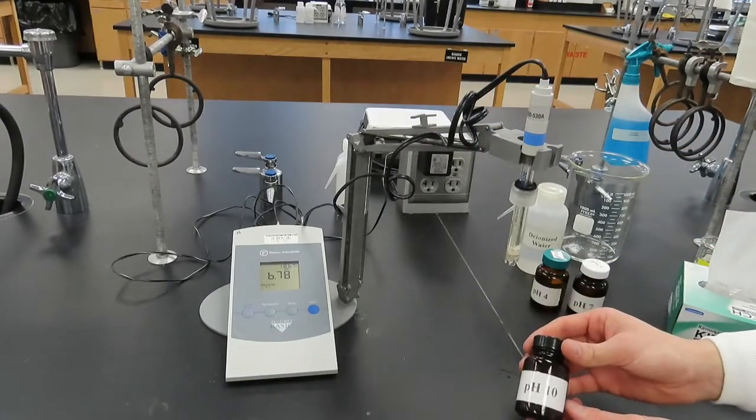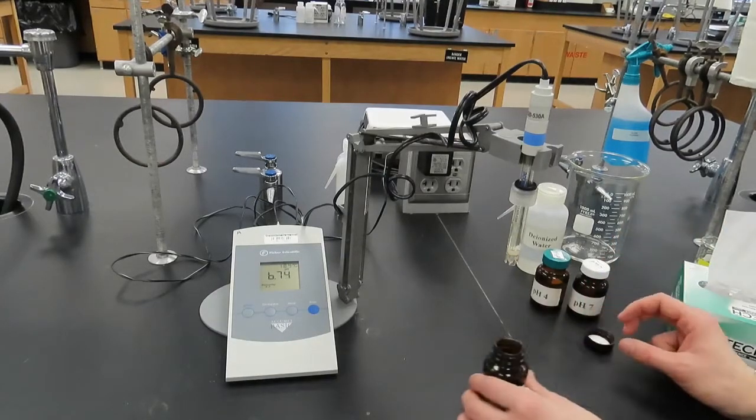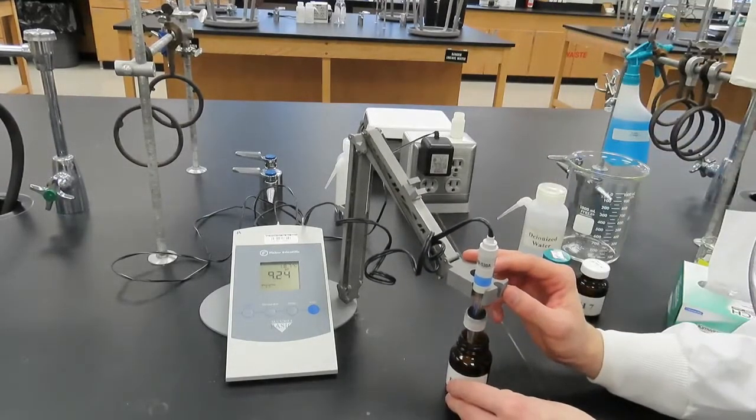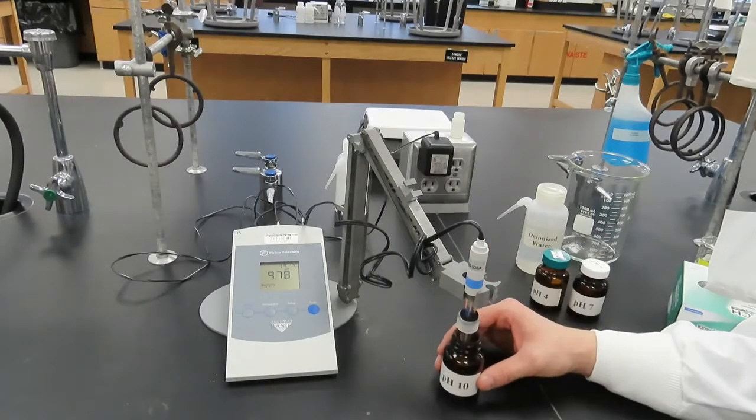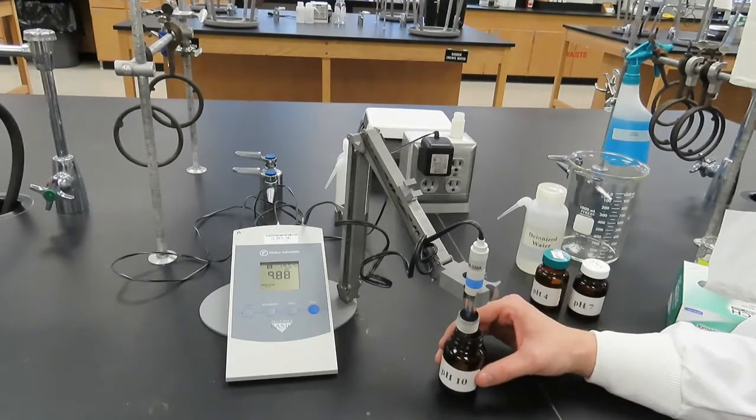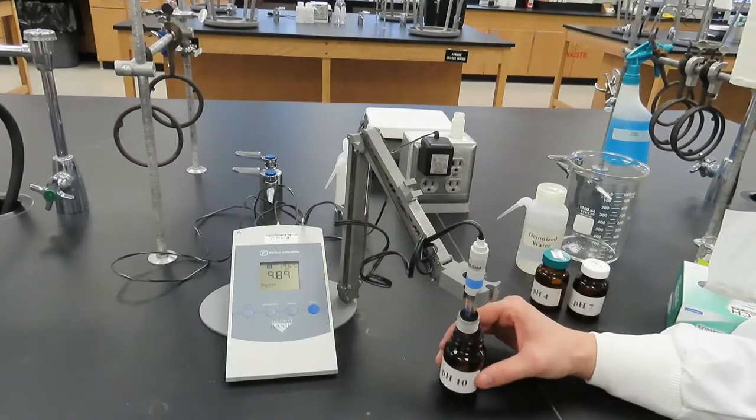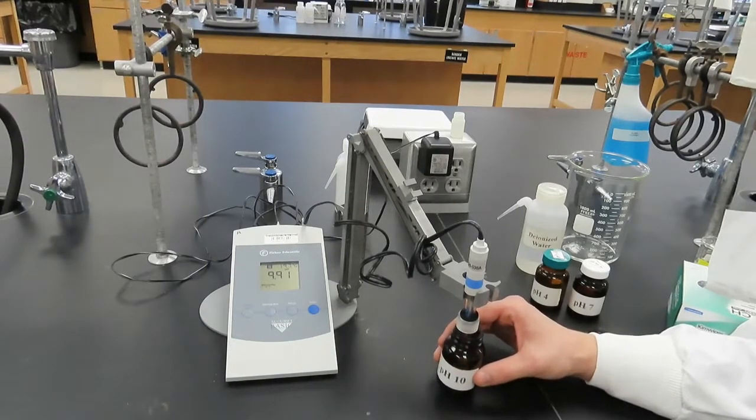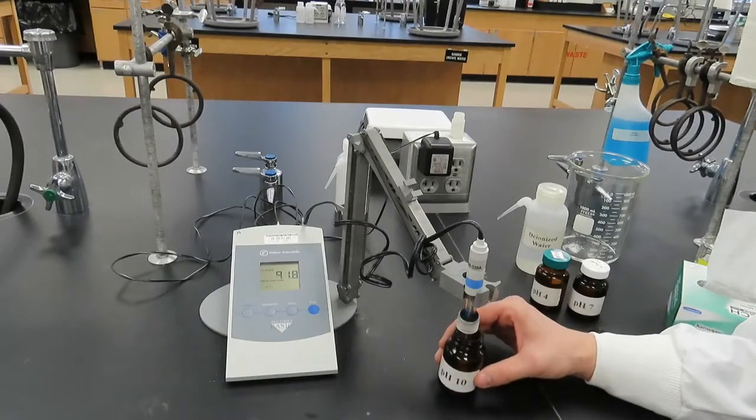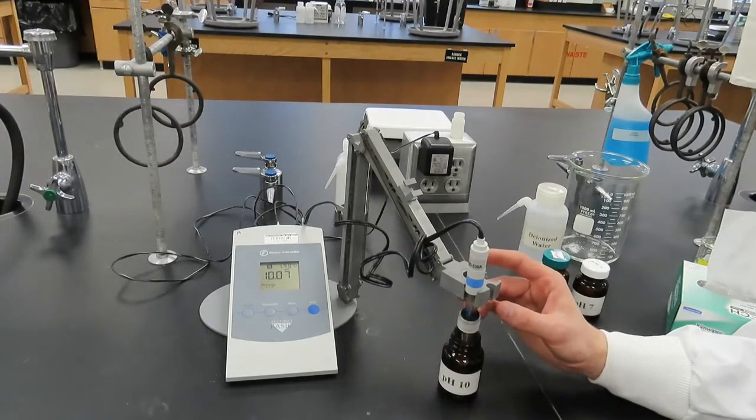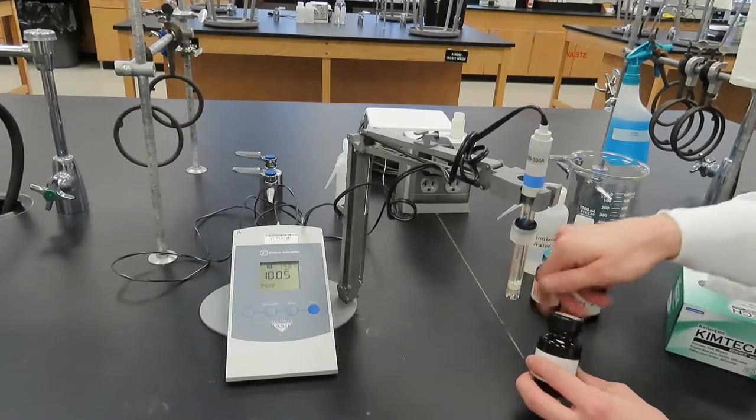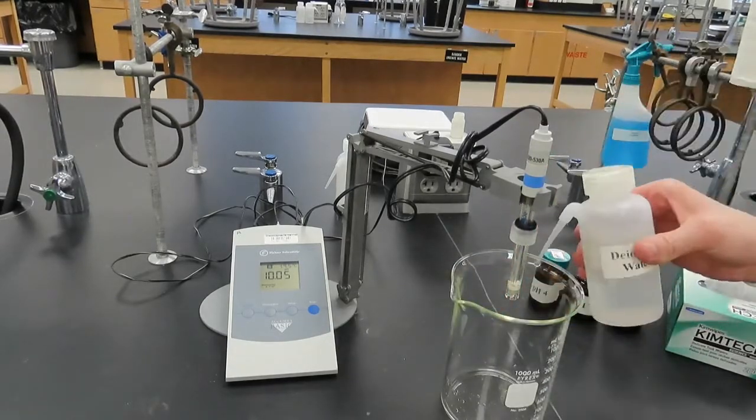Finally, we will repeat this process once more with a buffer solution of pH 10. When the pH value stabilizes, press the Standardize button once more while continuing to swirl the pH 10 buffer solution. If everything is okay, the pH meter will display good electrode. Remove the electrode from the pH 10 buffer solution, rinse, and dry it.